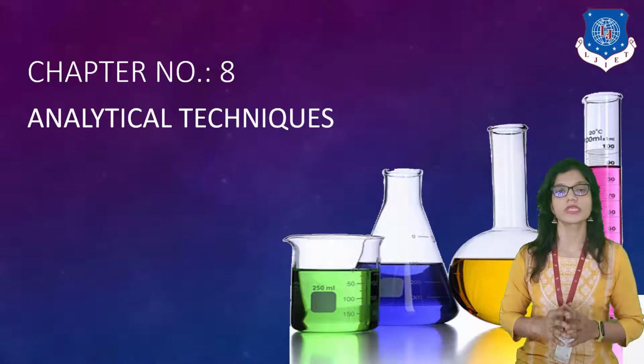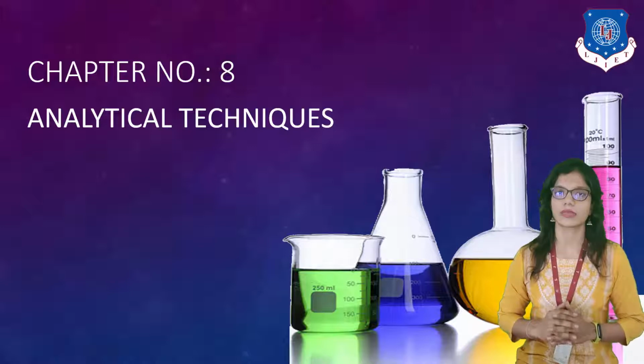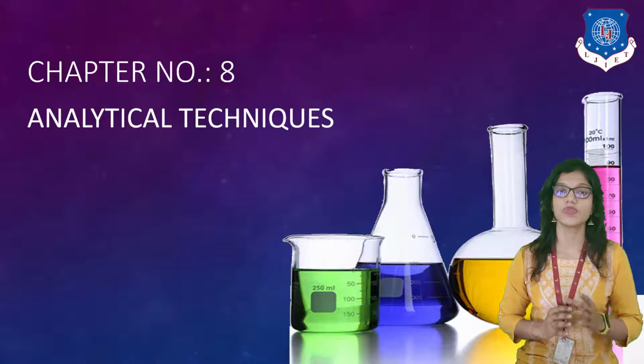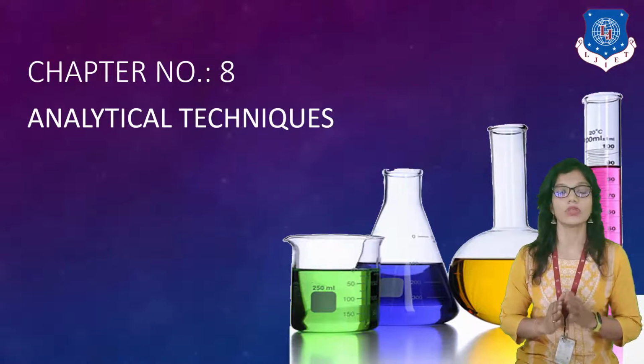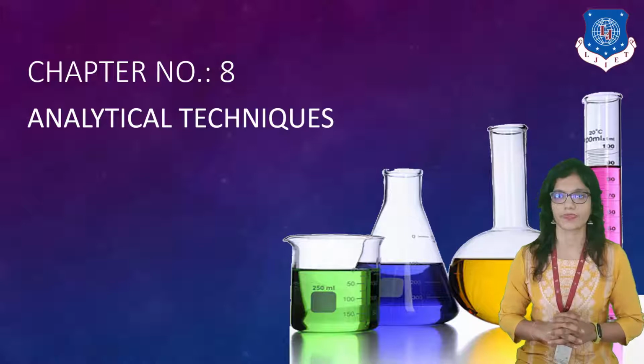So it involves different techniques, for example, the electroanalytical technique. The electroanalytical technique involves the electric field and the analytical field, that is, the application of an electric field in your analysis. That is how the electroanalytical methods, or electrochemical methods, came into existence.